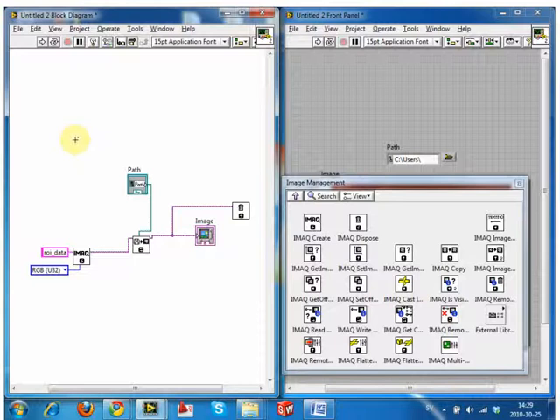As I mentioned briefly in the first one, and like I do a lot, if you see any of my VIs, I use this error string to determine order. Because one thing cannot action until all inputs have been read, essentially it cannot run this until this has happened. Well, it can't do that anyway because this is there. But for the example of these two, if I don't want this competition, I can do two things.